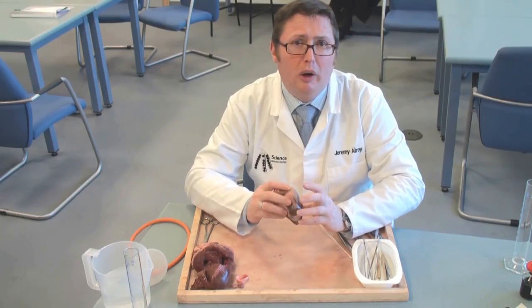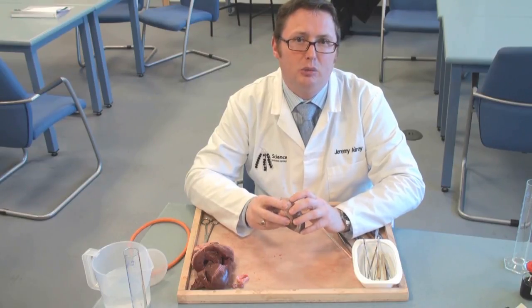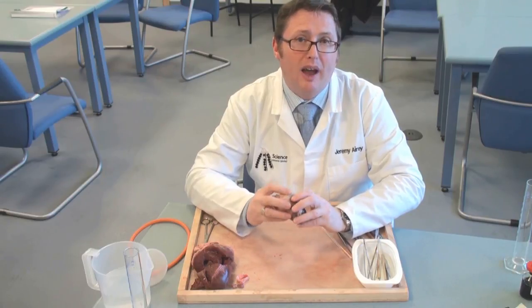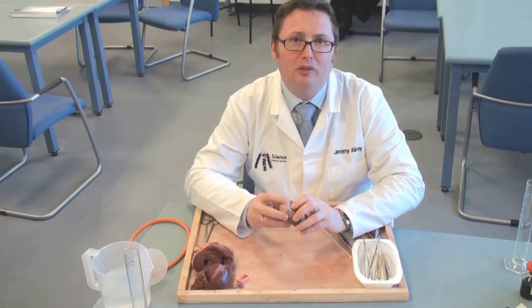You'll notice I'm not wearing gloves, and it really isn't necessary to wear gloves when you're doing dissection work — I prefer not to. But you must remember, even if you have been wearing gloves, to give your hands a really good wash when you've finished everything.